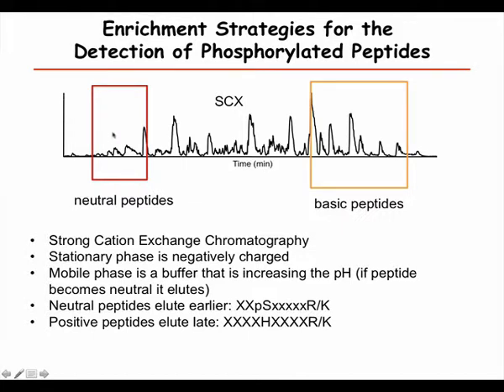So there are many of these different methods that you can either combine or use one or the other to get more enrichment of phosphopeptides.